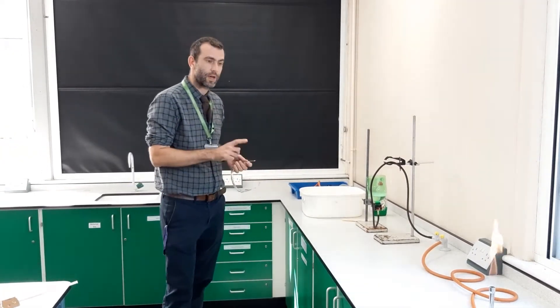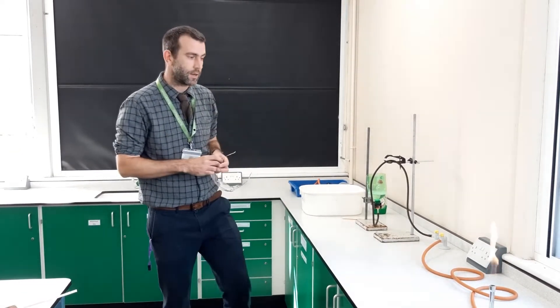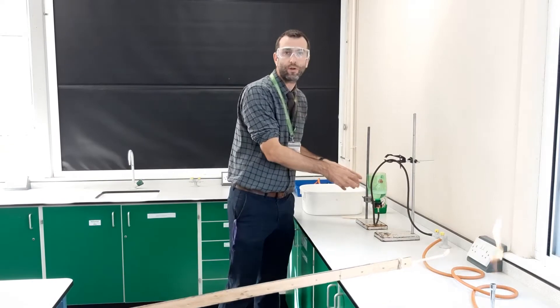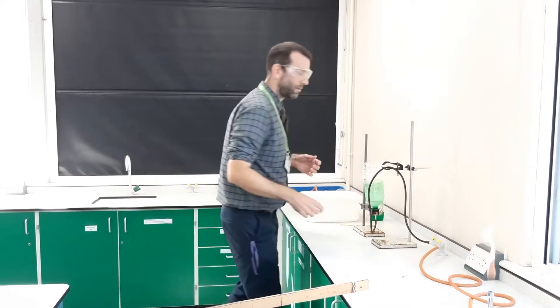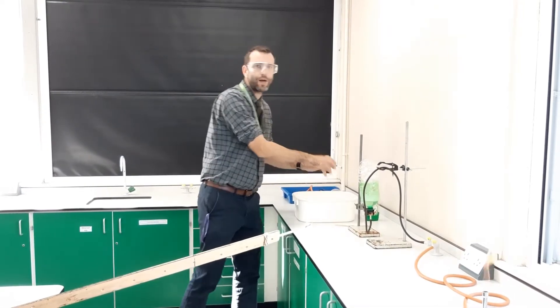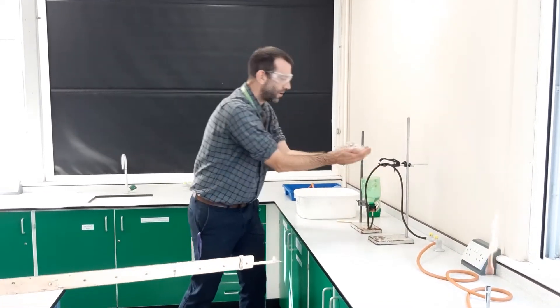Hello everyone, I'm Mr Smith and today I'm going to demonstrate combustion. Methane is the gas that comes out of our gas taps and what we're going to do here is trap the methane within bubbles of washing up liquid and then set light to my hands. I'll put my safety spectacles on and we're going to start bubbling the methane through the water mixed with washing up liquid. I'll make my arms and hands slightly damp so that I don't hurt myself, then take a handful of the plain bubbles and ask Miss Sparks to ignite them.